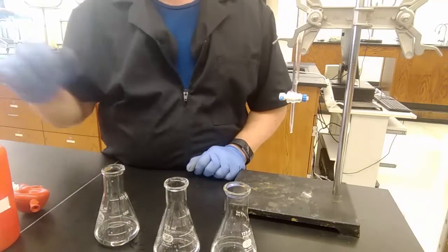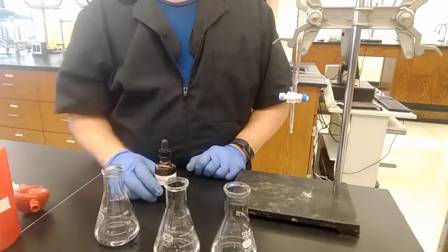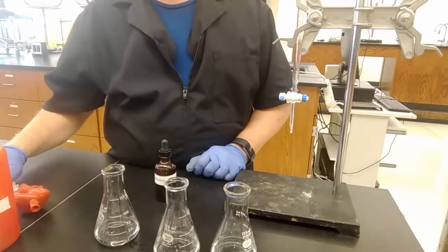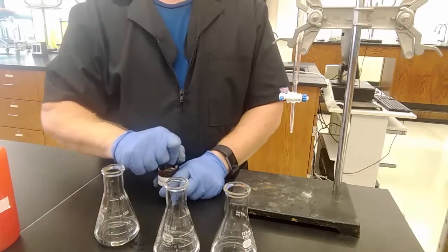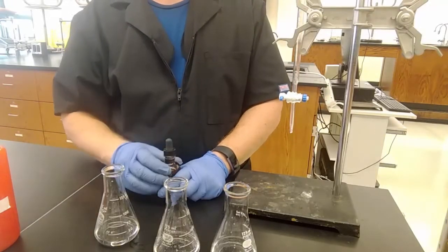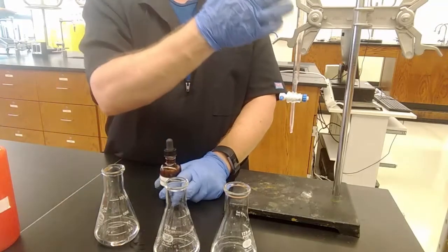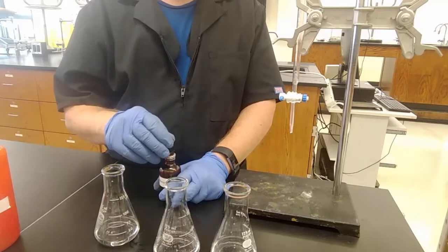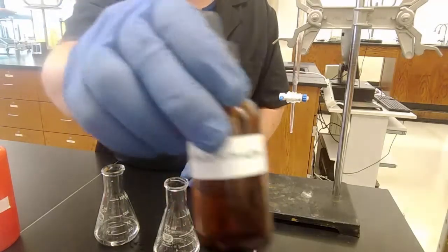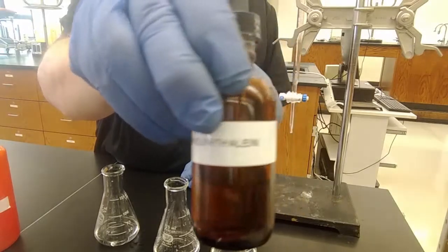All right, we're going to add an indicator because we absolutely need an indicator. Just like in the pH lab, other than the pH meter, everything changed color for us to be able to determine the pH. So same thing here. We got to have some way of telling when all of the acid in our vinegar flasks has reacted with the base that we're going to put into our burette. So the indicator that we use is called phenolphthalein, which is a solid that was dissolved in some water here.